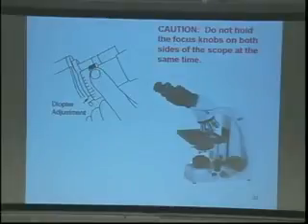But you've got to close one, then do the other, okay? And it has to be in that order, because the last adjustment you can do is the diopter, okay? All right, does that make sense? Then what you want to do is look with one, you want to create one field of view.